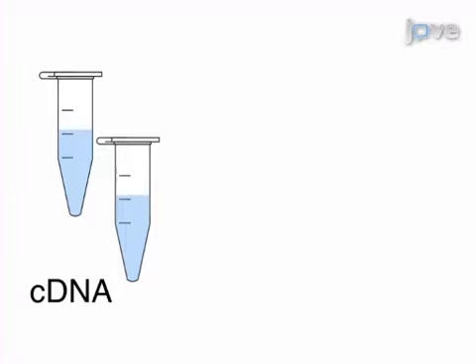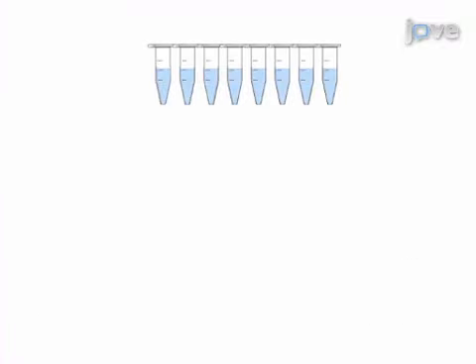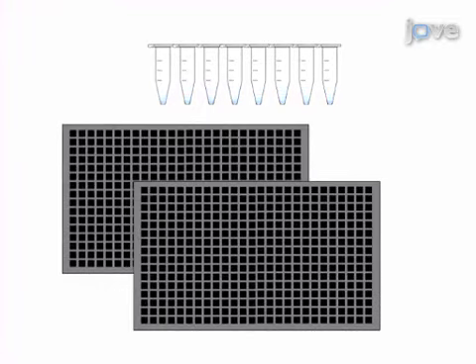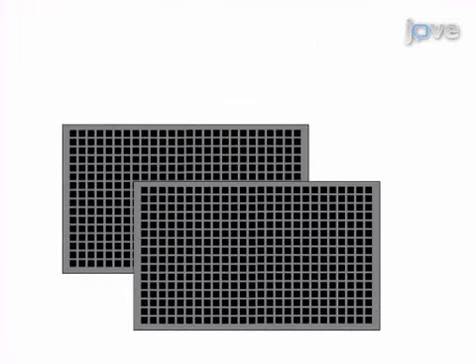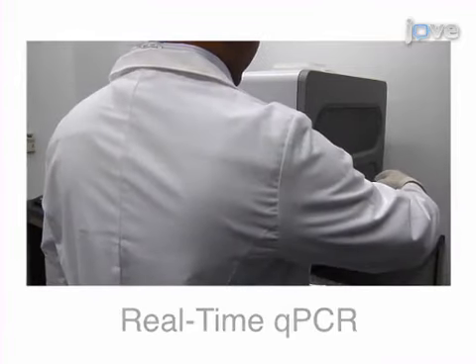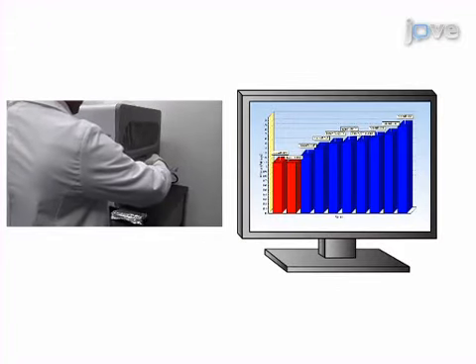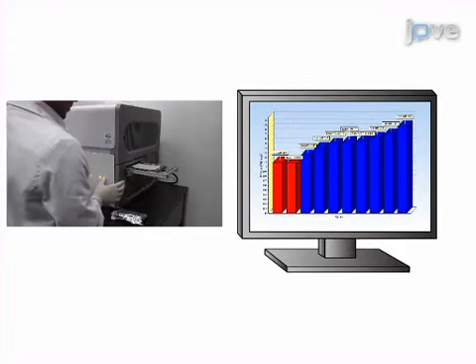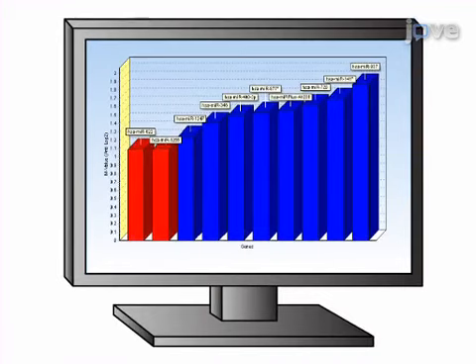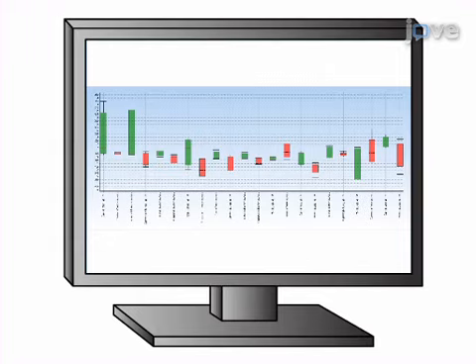Next, the cDNAs are mixed with a SYBR Green master mix, loaded into 384-well plates containing primers for 742 unique sequences, and amplified using real-time PCR. The final step is to analyze the data acquired from the real-time amplification. Ultimately, the results can be expressed as a fold change increase or decrease over a control, and visualized in various graphic representations.